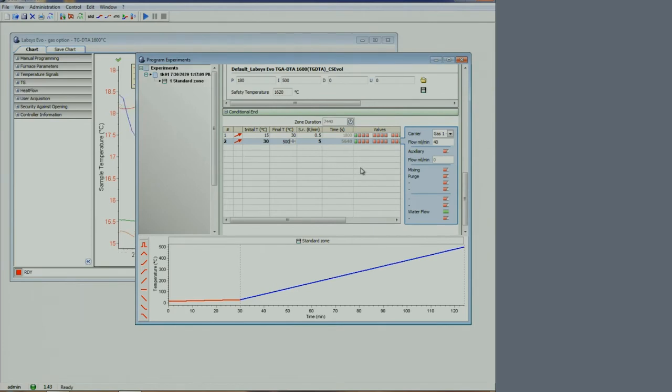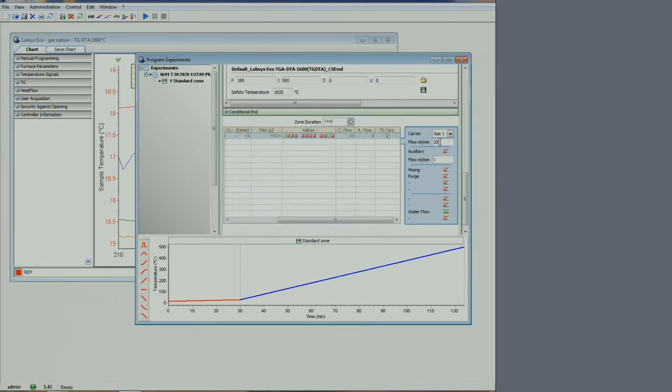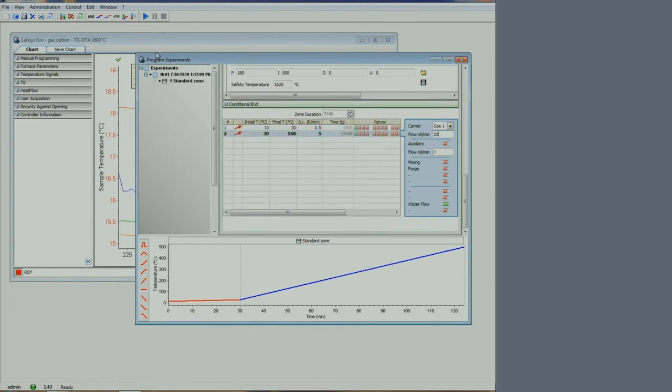We want to set the gas flow rate for this stage of the measurement at about 20 milliliters per minute. Using the slide bar, reveal the right side of the window and check the automatic tare box. Always check it to get a tare of the balance before starting the run. At this point, we can start the run by clicking the play button on the top menu.